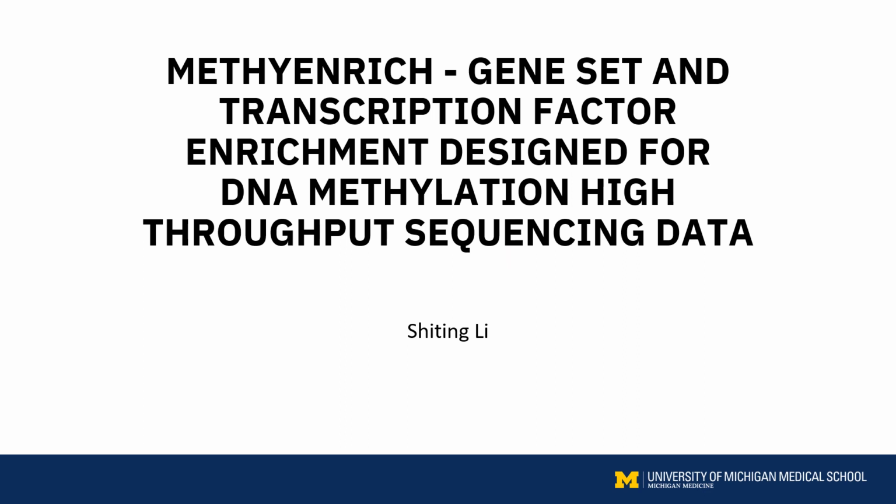I'm from the University of Michigan, Department of Computational Biology and Bioinformatics. Today I'm going to show a tool called METHYENRICH. METHYENRICH is a gene set and transcription factor enrichment tool. It's specifically designed for DNA methylation high-throughput sequencing data.